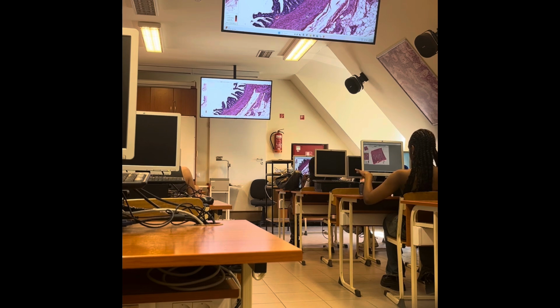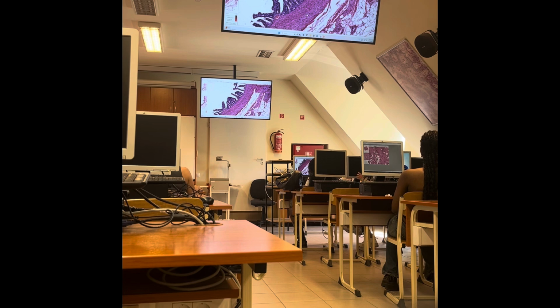Exocrine is general, and among the exocrine glands we have three versions: merocrine, apocrine, and holocrine. This one is an apocrine-like mechanism. Some of the secretory material accumulates in the apical portion of the cells, and then it is released together with some part of the cytoplasm. That is the definition of apocrine secretion.